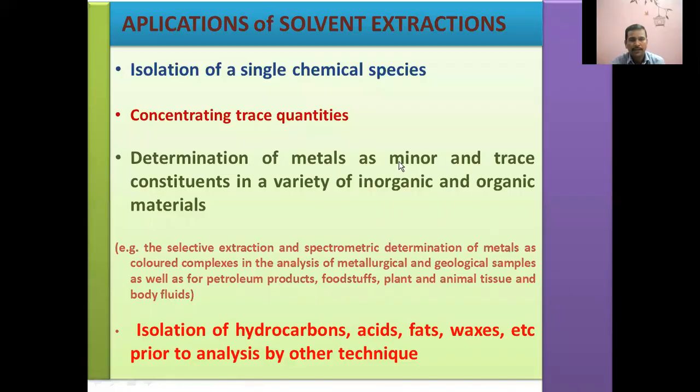So this is how the continuous extraction will be done. Continuous extraction is a process in which the solutes are going to be extracted continuously. Solutes are having lesser distribution ratio, that is the value of D less than 1.